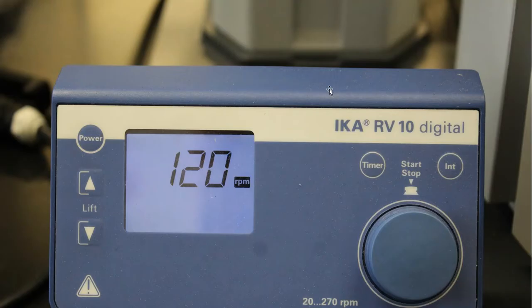All right, so here over to the left is going to be an RPM setting. This is another setting that I need to make on the rotovap instrument. And this is how fast that Florence flask will turn. They call it rotary evaporator because it rotates.